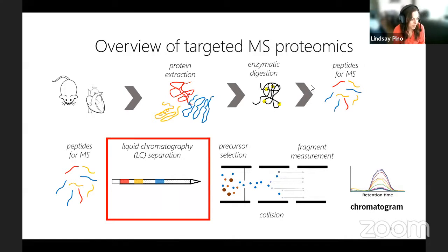How can you be sure your peptide of interest is unique to the protein of interest and not from another protein in the matrix? One thing you could do is an in silico approach: take the entire background proteome of your sample and see if that peptide occurs in any other proteins. You could also perform empirical experiments with a peptide standard and spike that peptide standard into multiple different examples of your matrix material to see if the endogenous level of that peptide is changing across different matrices.